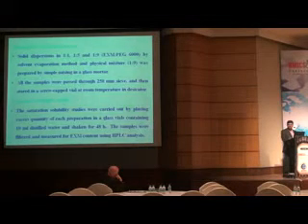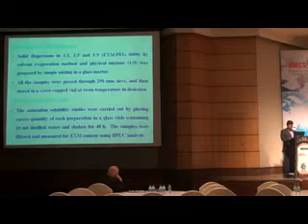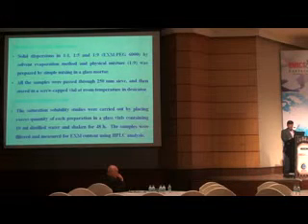make the solid dispersions. Solid dispersions were prepared at ratios of 1:1, 1:5 and 1:9 by the solvent evaporation method, and a physical mixture of 1:9 was prepared by simple mixing in a glass mortar. All the samples obtained were passed through a 60 mesh screen, or 250 micrometer, and the product obtained was stored in a desiccator.